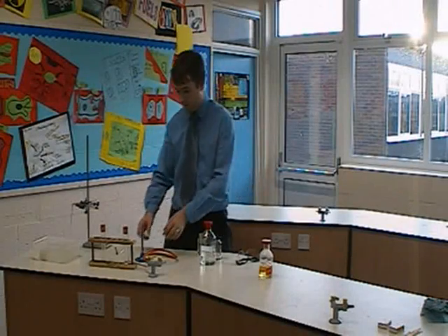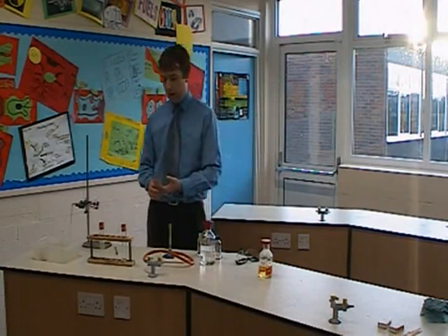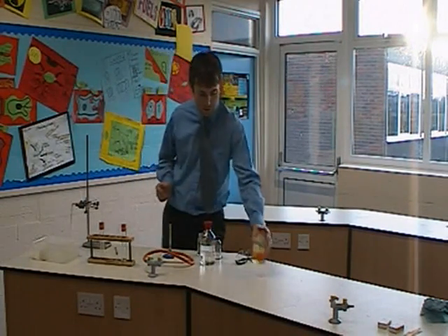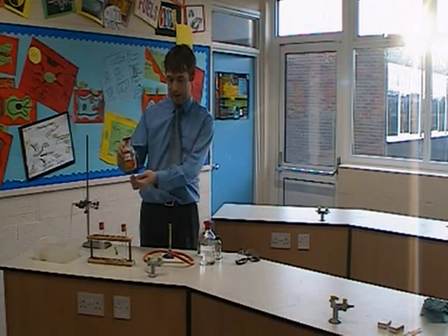The actual test for the experiment we've just done is to see whether we've actually produced the product we're expecting. I've got some bromine water which is, as you can see, a yellow liquid.